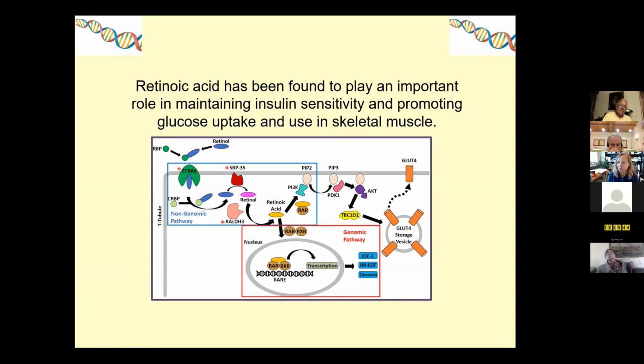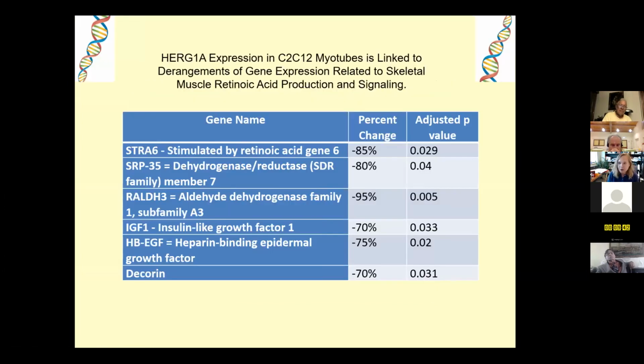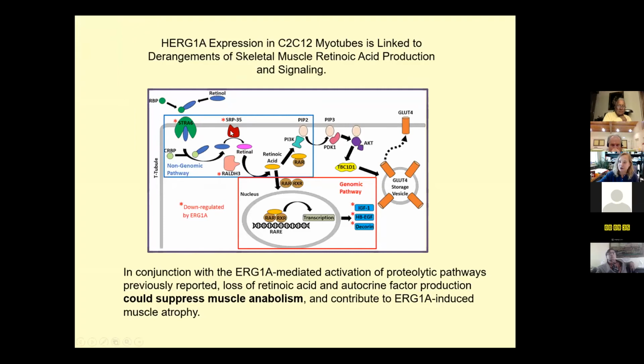receptor, the GLUT4 receptor. What we found is there was an overall decrease in a number of these genes. These shown here by the star. These that are part of the non-genomic and part of the genomic pathway.